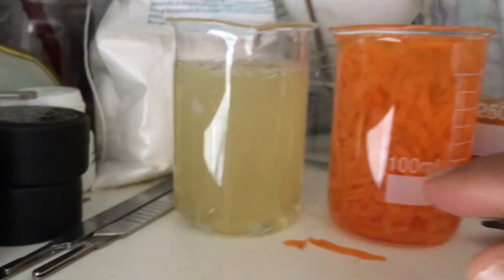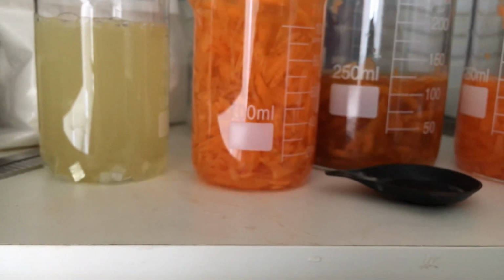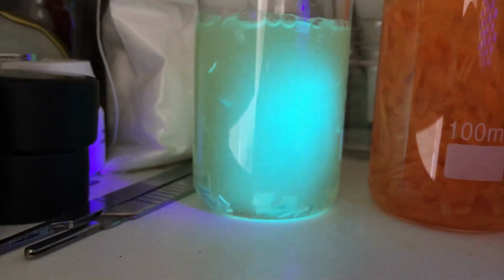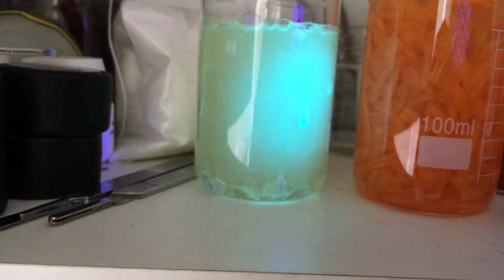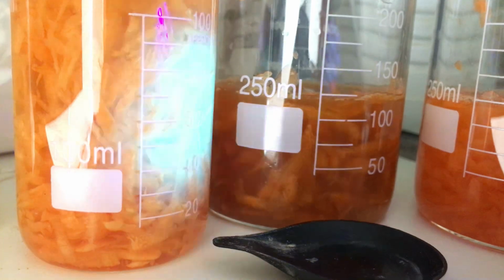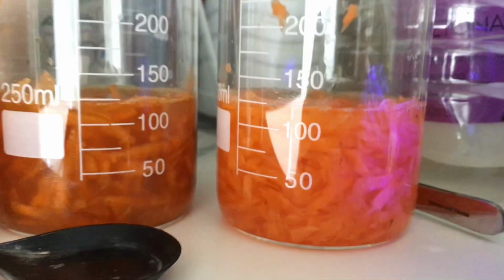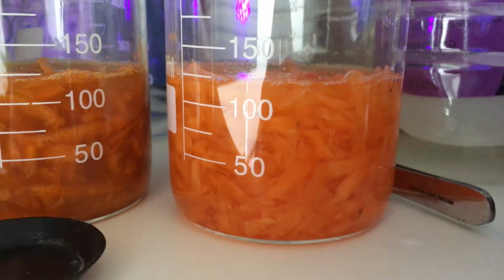And yeah, here you see there's a color change already from the reaction. And let's test the blacklight. So this is already a brighter green, but it's still a green color, even though it's coming up blue on the camera. It's still the harmaline green. This one is also still the harmaline green. This is a much darker green color, but nothing really changed for these. And these two are still the same color as well. And there's no UV reaction, blacklight reaction to the carrot control.